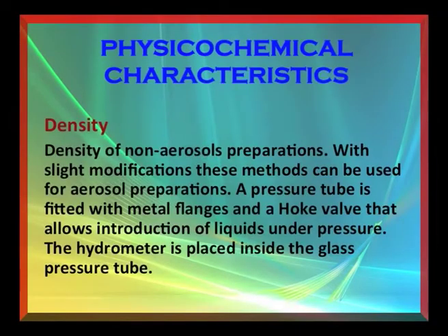Another parameter, that is density. The density of an aerosol formulation may be accurately determined by the use of a hydrometer or a pycnometer. These methods are generally used for density of non-aerosol preparations. With slight modifications, these methods can be used for aerosol preparations.